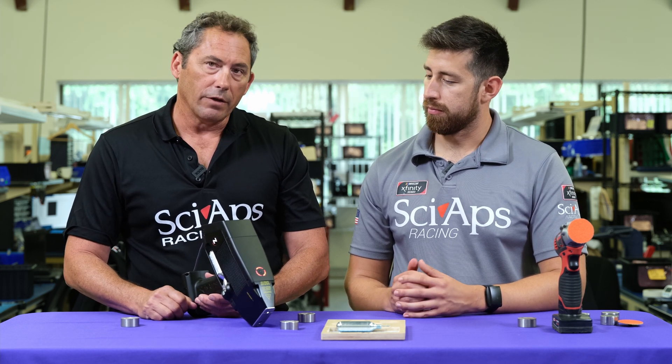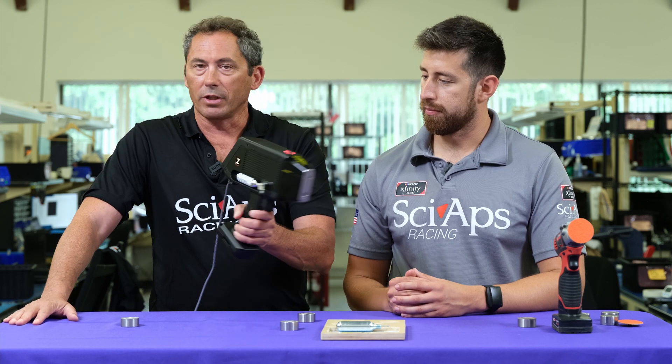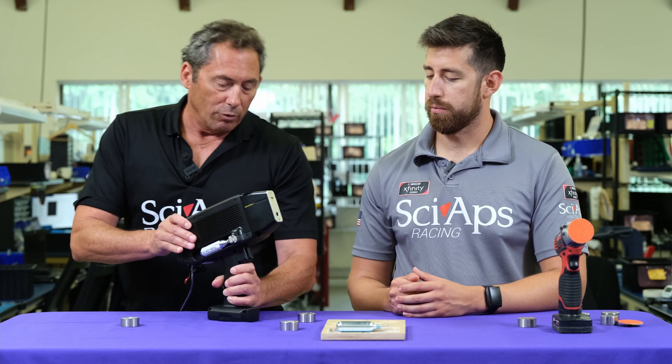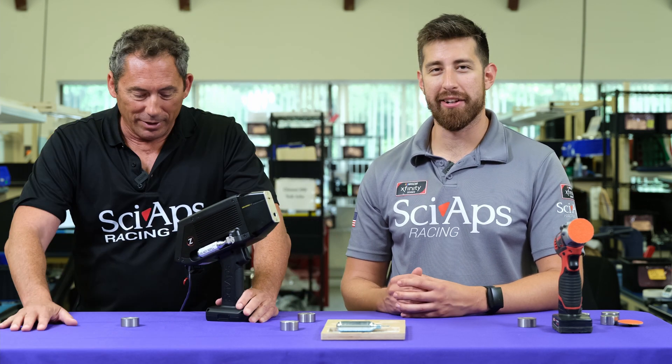If you choose alloy mode, you don't have to wait for the pre-burns and everything — you just go ahead and shoot them. It's a great new analyzer. We're really looking forward to getting this thing out and showing it to people. Coming to a scrapyard or a PMI facility near you.